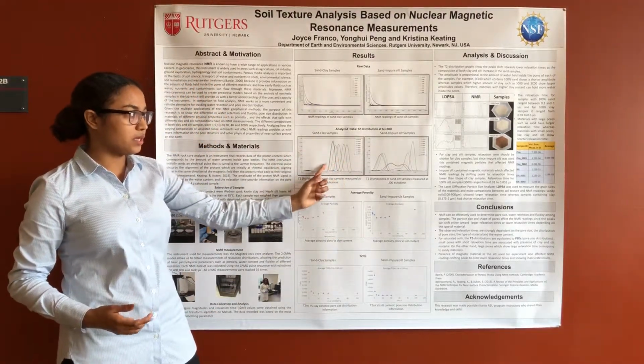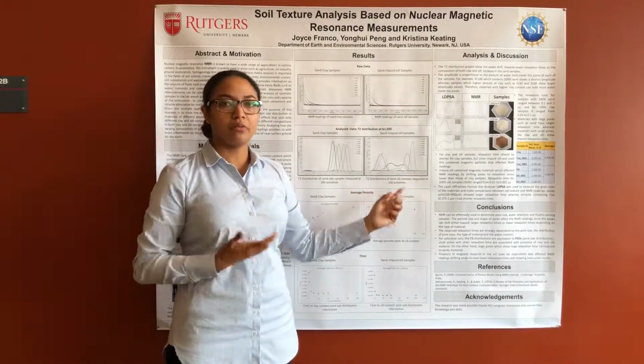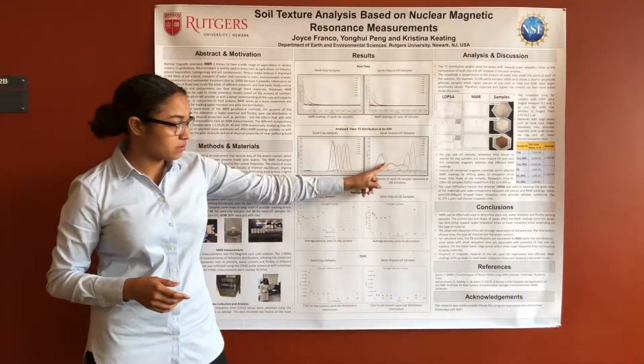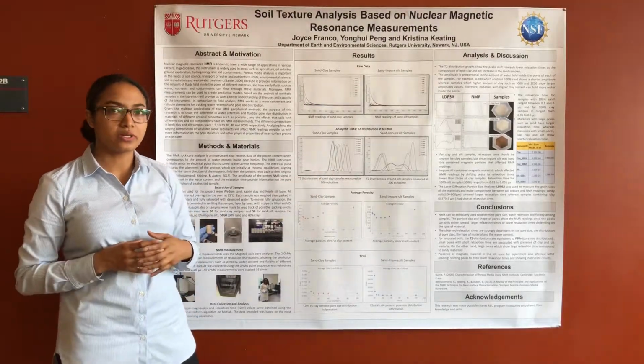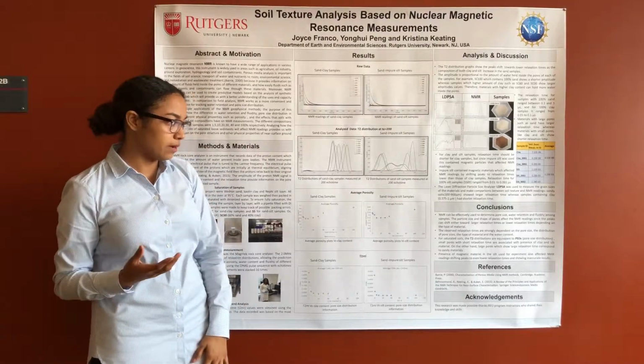All the peaks that you see here show a pattern, and this graph does show a pattern, but it's not really accurate, because the relaxation time of the silt sample should be larger than the relaxation time of clay, because clay has small pores in comparison to silt samples.